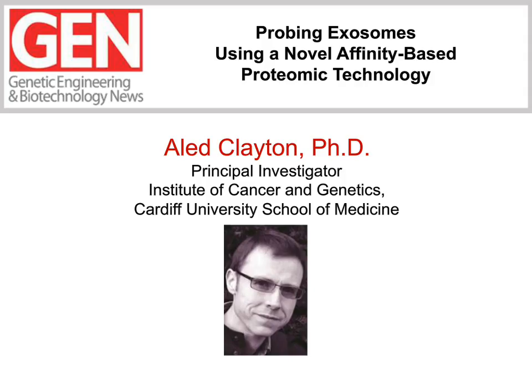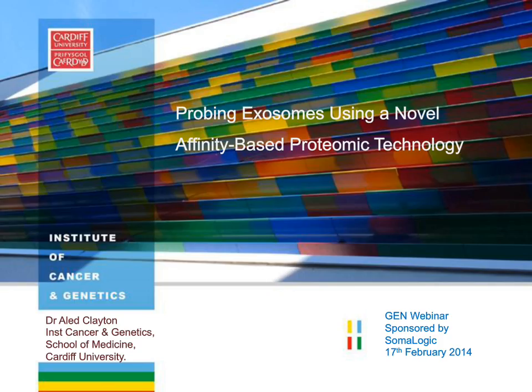Thank you, Stephen, for the lovely introduction and the very eloquent explanation of our complex technology. So we had a collaboration with SomaLogic quite recently, exploring the potential use of that technology, which you just heard about, in probing the proteome of exosome vesicles.